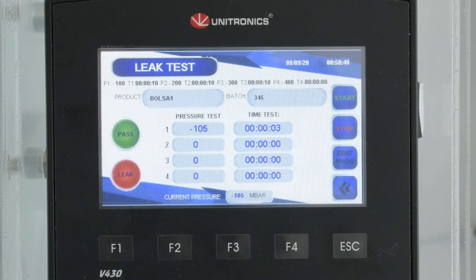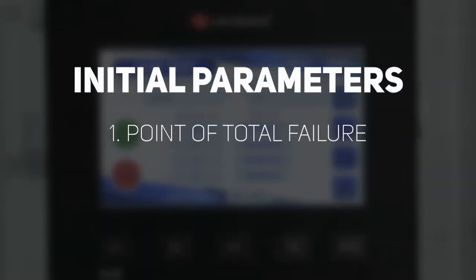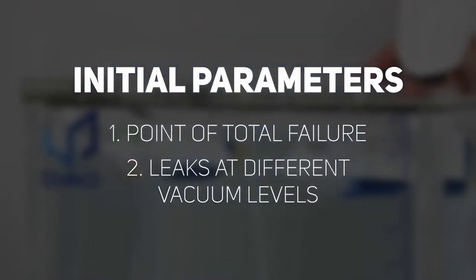However, since the norm does not specify the level of vacuum necessary to detect those leaks, we need to find two initial parameters: point of failure and leaks at different vacuum levels.